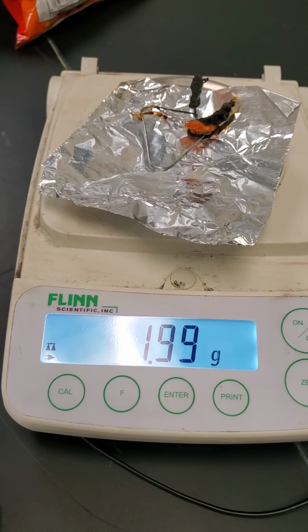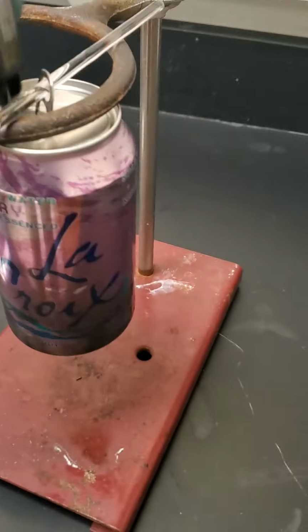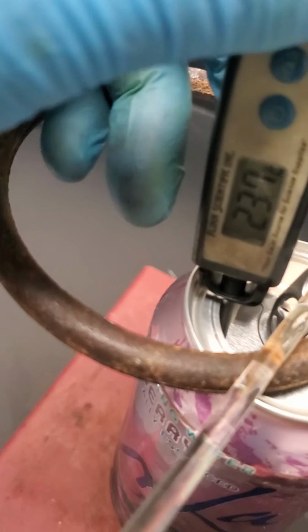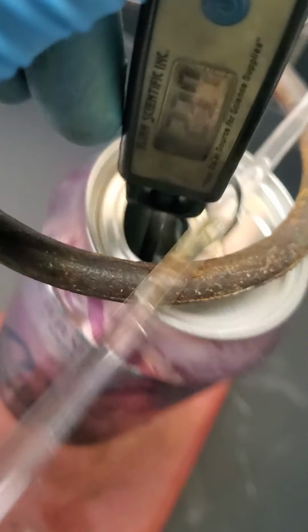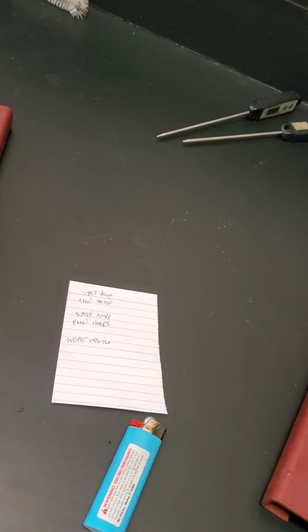Okay, there's our final mass for the Cheeto Crisp. And our final temperature for the Cheeto Crisp. Okay, so that just showed the data for all three samples.